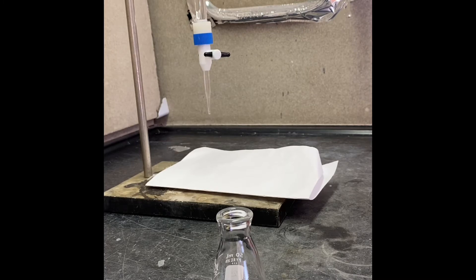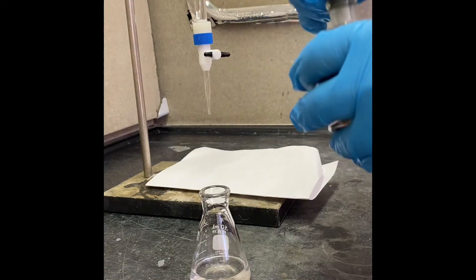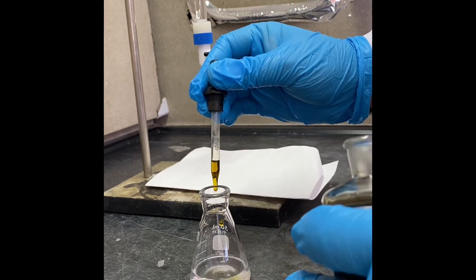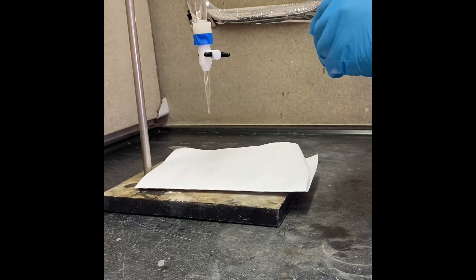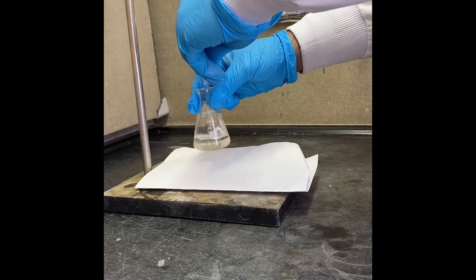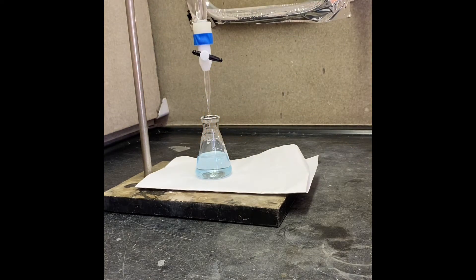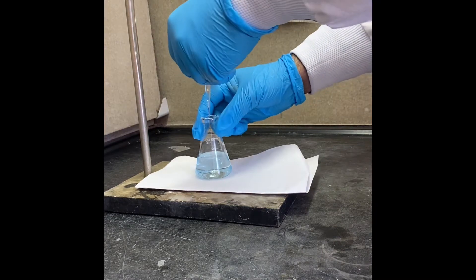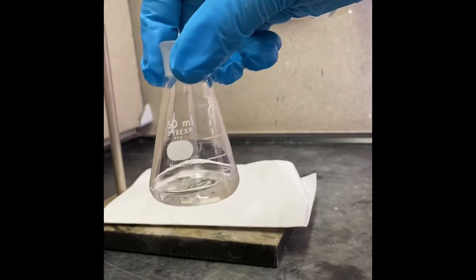I have 10 ml of acetone in my flask and I'm going to add 10 ml of reaction mixture and indicator. Again initial color is yellow. Let's start our titration. We got our endpoint — that's our 50-minute solution.